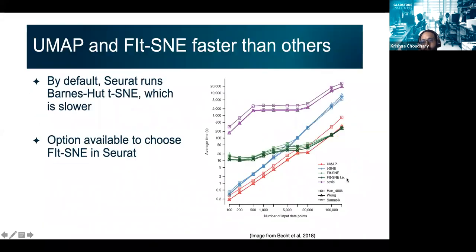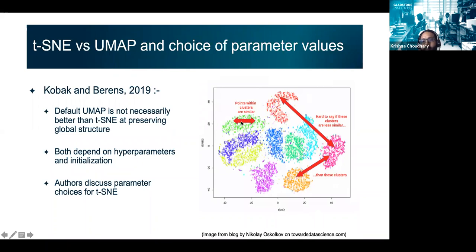And I think I mentioned this briefly, but in a UMAP or t-SNE plot, we should not try to read too much into the distances between different clusters. If two clusters are close together compared to another pair of clusters, it does not mean that they are more similar than the other clusters. We should be cautious about making those kinds of interpretations.